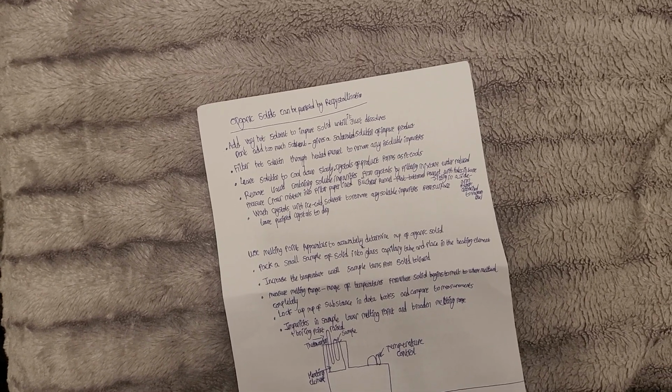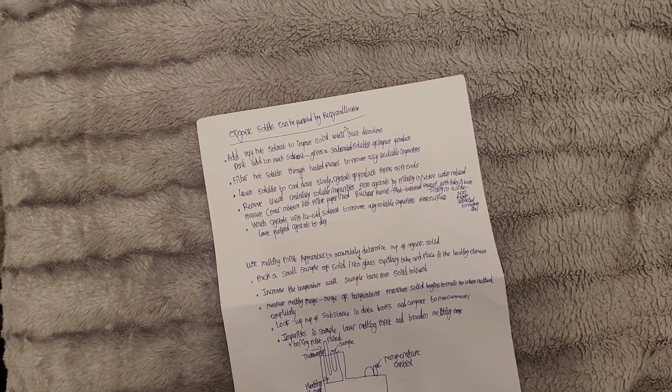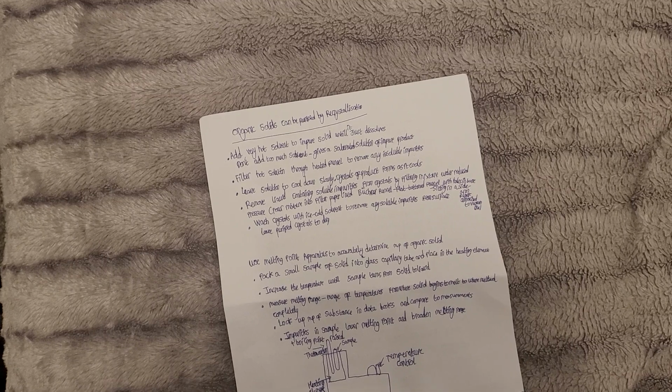Filter the hot solution through a heated funnel to remove any insoluble impurities. Leave the solution to cool down slowly. Crystals of product form as it cools. Remove the liquid containing soluble impurities from the crystals by filtering the mixture under reduced pressure.